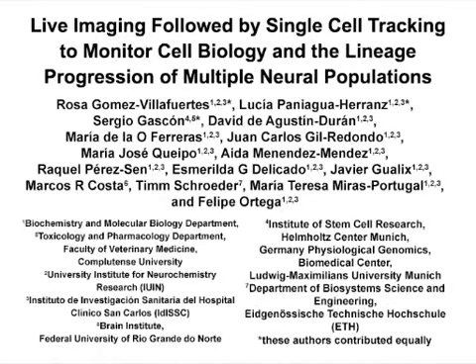The overall goal of this procedure is to perform continuous live imaging and single-cell tracking of multiple neural cell populations, followed by post-imaging immunocytochemistry. This method allows the analysis of any cellular events that take place within the tracked time period. This method can help to answer key questions in the neuroscience field, such as cell behavior and lineage progression of multiple neural populations, as well as the identification of their modulators.